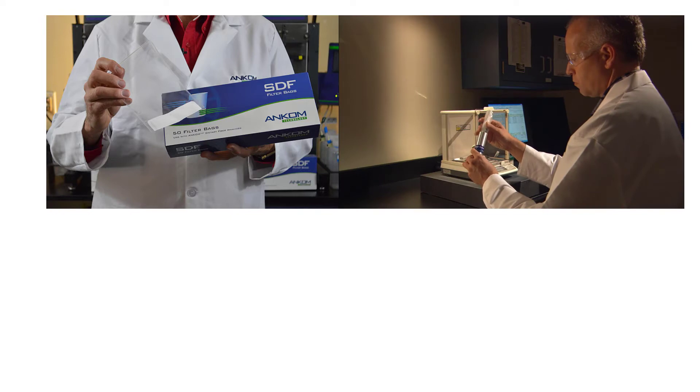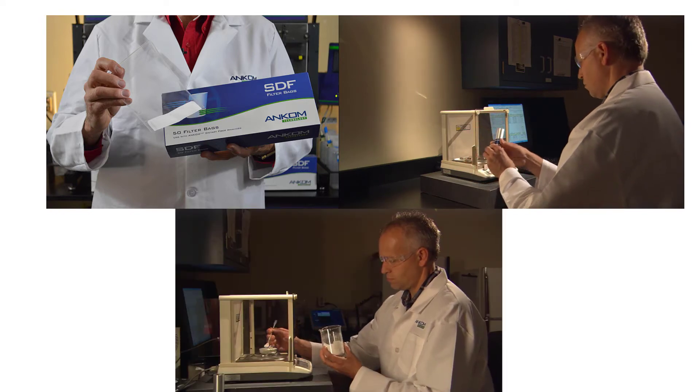Already in use in large and small labs in over 30 countries, the ANCOM dietary fiber system is freeing up technicians to complete all the other work on their busy schedules. With improved inter- and intra-lab accuracy and precision, redos are virtually eliminated. Here's how the system works: dual chamber filter bags, samples, and diatomaceous earth are weighed.